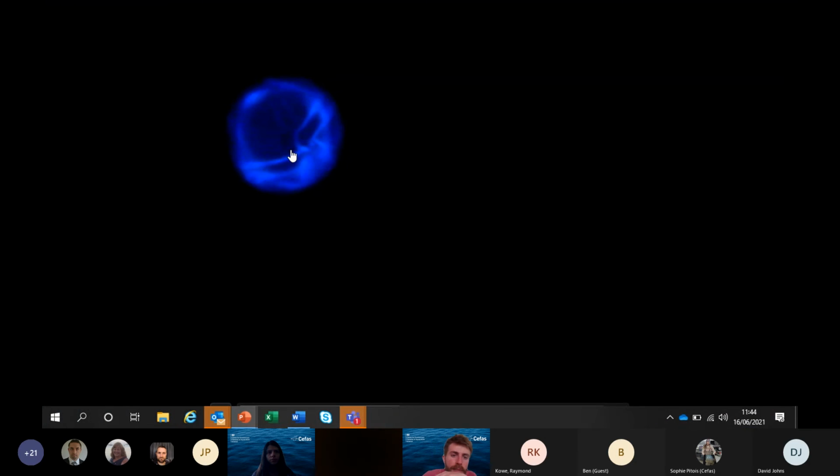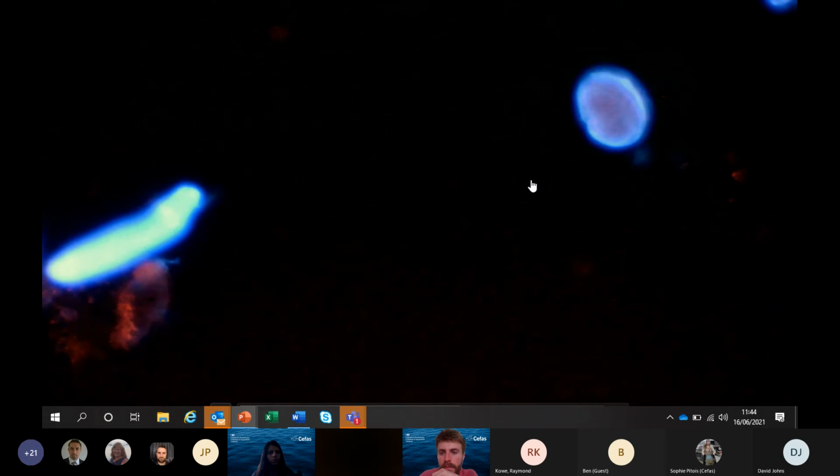So this is, I believe, an Alexandrium, under the fluorescence that I mentioned earlier. And you can see how the lines of that girdle and the plates are much, much clearer. The video doesn't pick it up nearly as well as you'd see it under the microscope. So you have to forgive me if the plates aren't totally obvious.